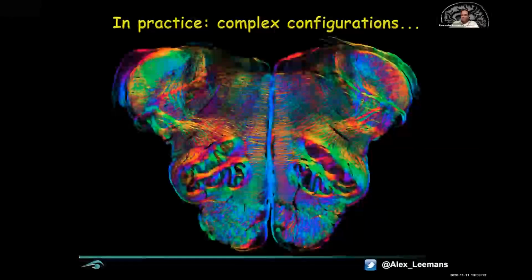This is not a butterfly. It's not some exotic butterfly. This is a micro section in the region of the medulla oblongata near the brainstem. It's a polarized light imaging microscopy section with the same kind of definition of the colors. Colors reflect orientation, brightness reflects white matter axonal fiber pathways. And you can appreciate now the diversity, the heterogeneity of orientations. This is a technique, unfortunately only ex vivo, but it has a resolution at the micrometer scale.